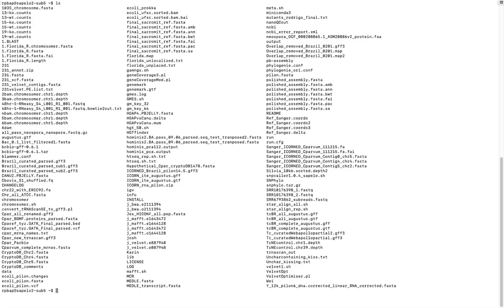For now, I would like to show you how to do the whole annotation so you can start to get your results. The first thing I did was log in to Sapolis, so I'm in my home directory. If I just type `ls`, you'll see that I have many things here, but in your case, it will be your own files.